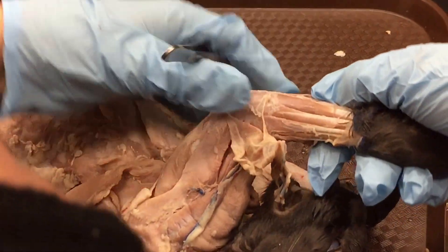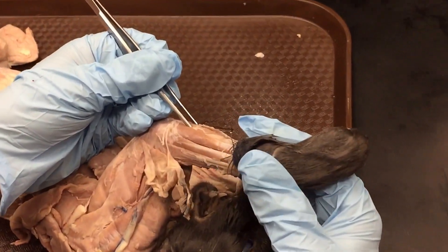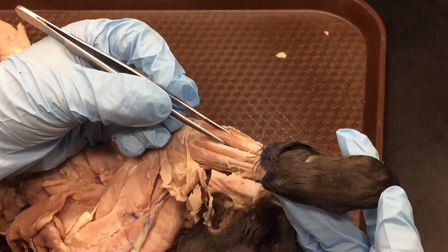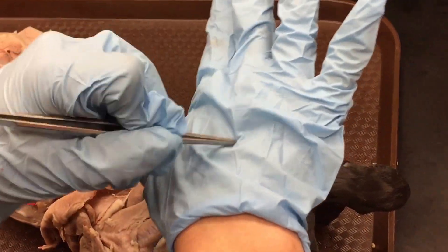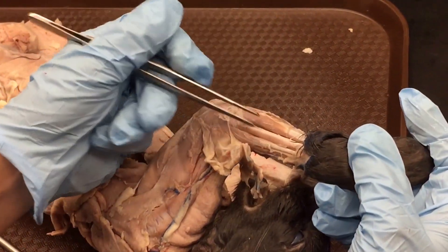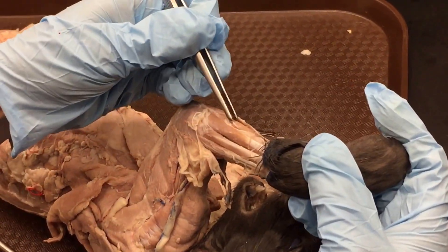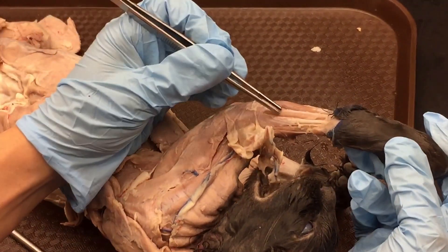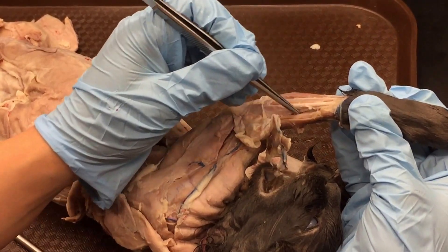If we flip to the extensor side, the first major muscle is the extensor carpi ulnaris, beside the flexor carpi ulnaris. Then extensor digitorum lateralis, and extensor digitorum, which is typically in line with the middle finger — so that's a useful marker on the extensor side. It's probably easiest to continue from the ulnar side: extensor carpi ulnaris, extensor digitorum lateralis, extensor digitorum.